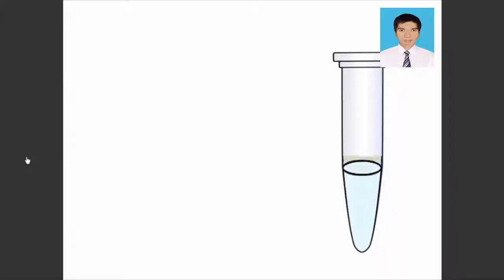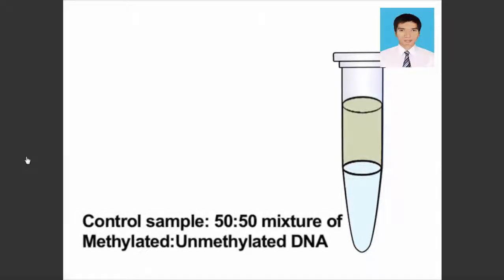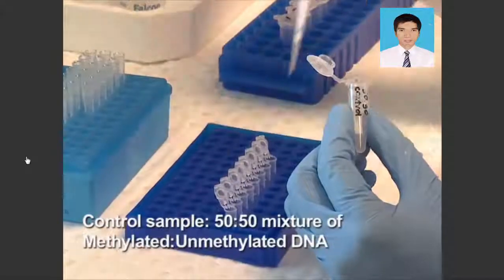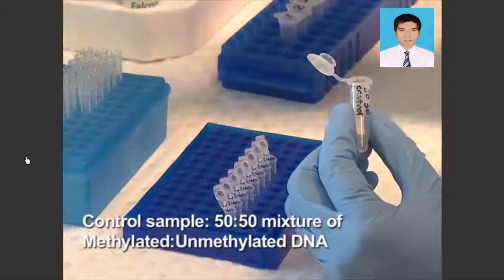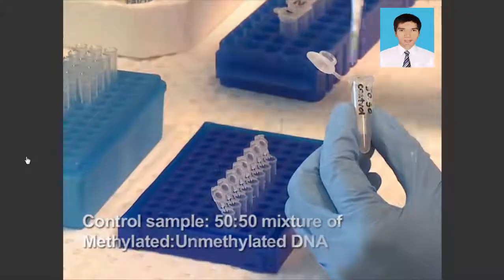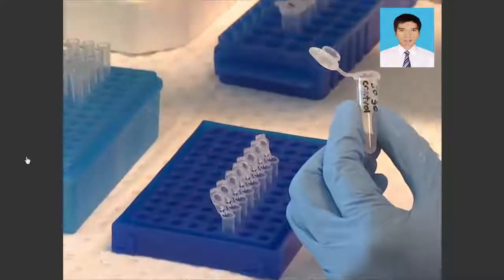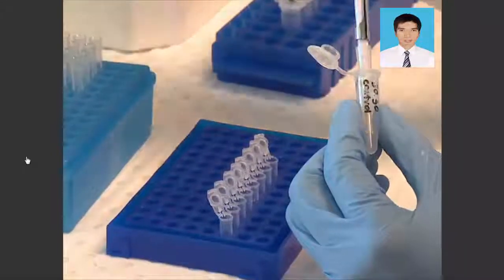To test for amplification bias of methylated or unmethylated material, use a 50-50 methylated, unmethylated, fully bisulfite-converted control sample to test for proportional PCR amplification with bisulfite conversion-specific primers and PCR reaction mix.